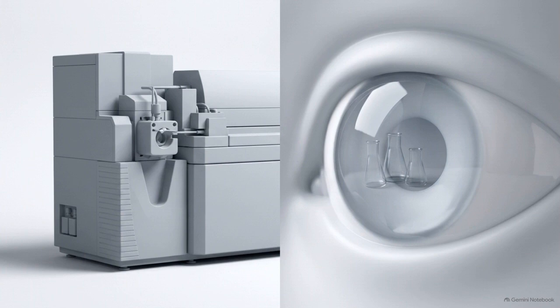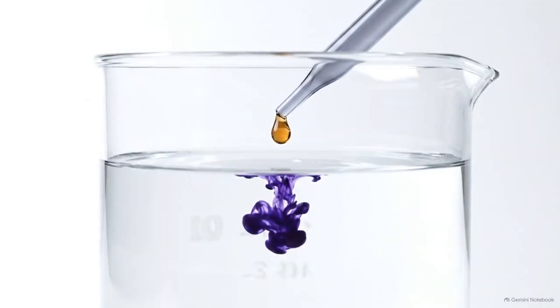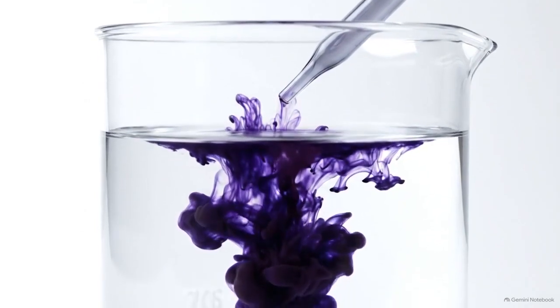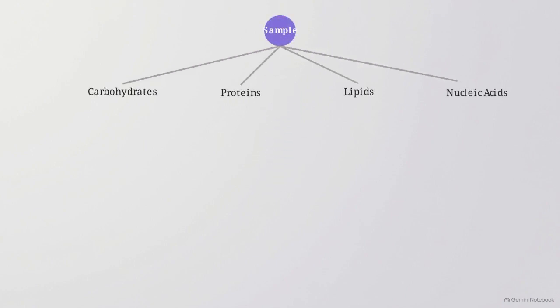At a macroscopic level, these molecules are indistinguishable. The biochemical assay is the solution to this problem. These tests translate hidden molecular shapes into macroscopic color changes that we can actually see. Biological molecules possess functional groups, specific atomic arrangements acting as triggers. When exposed to the right reagent, they lock together, triggering a reaction.